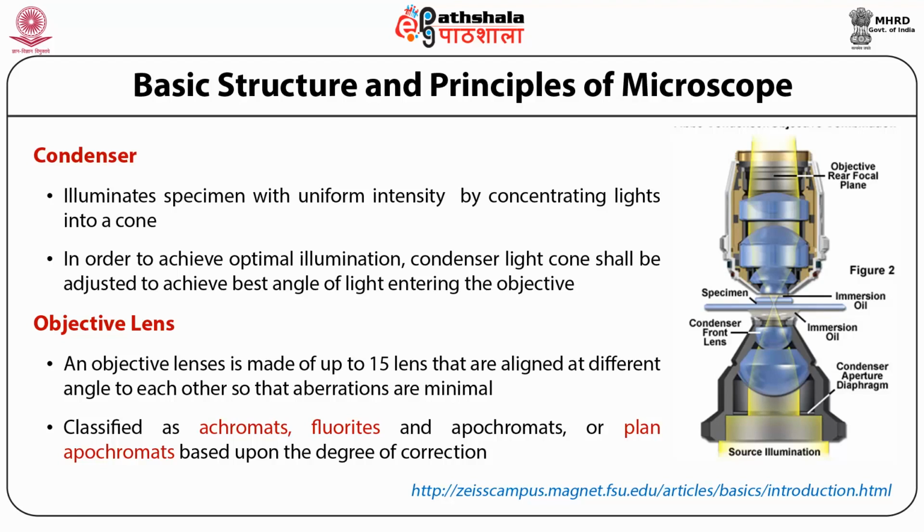It is very important that we have proper illumination so that we maintain a cone shape configuration in which the light is coming and hitting the sample. If it is not maintained, the sample would not be uniformly illuminated, resulting in poor contrast.